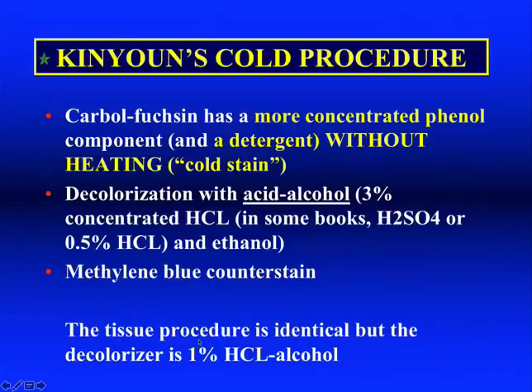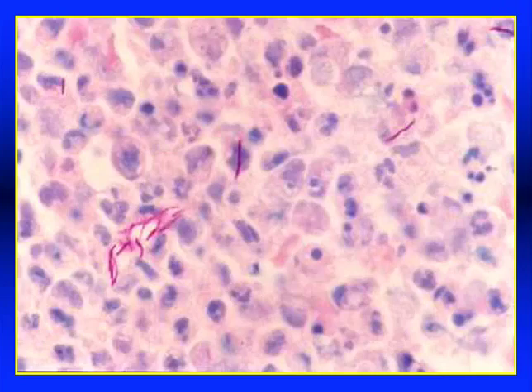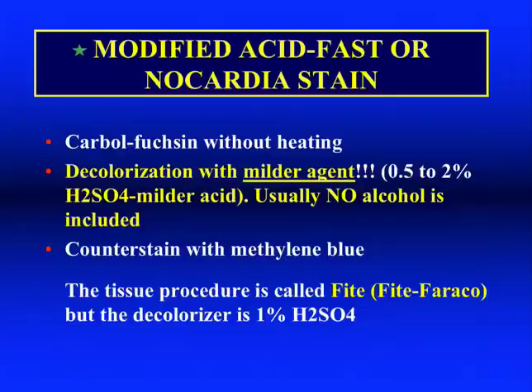And that's what we call the Fite stain in tissue. And that is a traditional Kinyoun, which is an acid-fast bacillus, which is a long bacillus that stains like a red snapper. It's not filamentous branching like the actinomycetes that I'll show you in the next slide, like nocardia and so on, but they are long bacilli, and they are beaded if I were to use oil to show you. And it will become clear soon why we call them beaded.